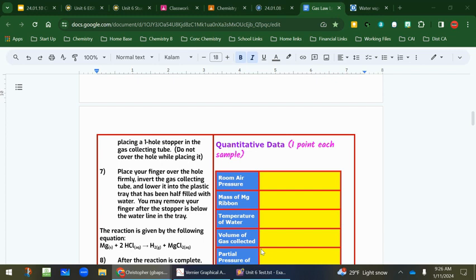So you have to hold this under the water the whole time the reaction is going. You have to hold this under the water until you get your final volume reading. We will show you how to do that, ladies and gentlemen. There is a trick to that. Only after you have gotten that final volume reading can you turn this back over, take the cork out, and dump this down the drain. Questions? Okay.